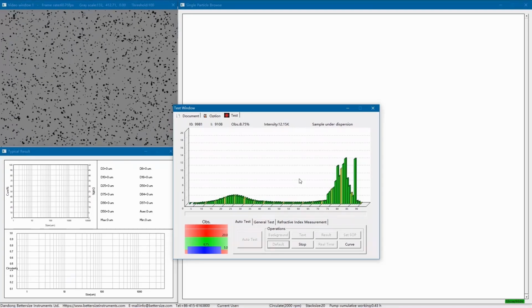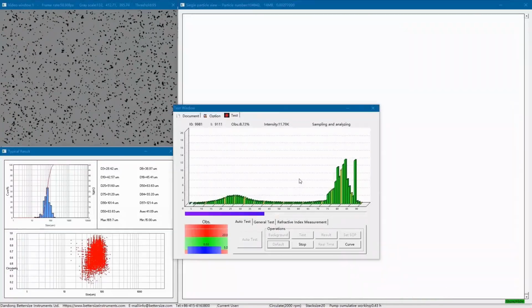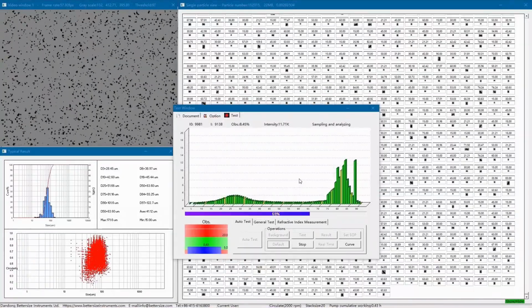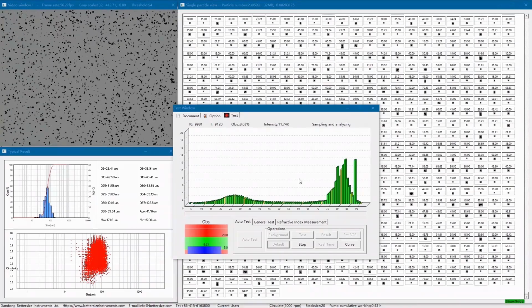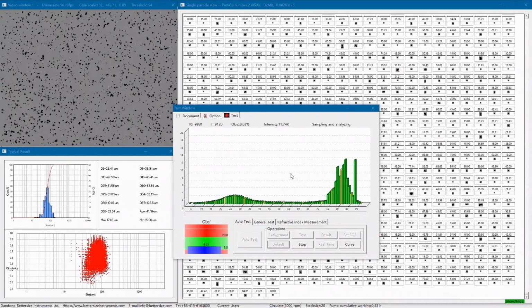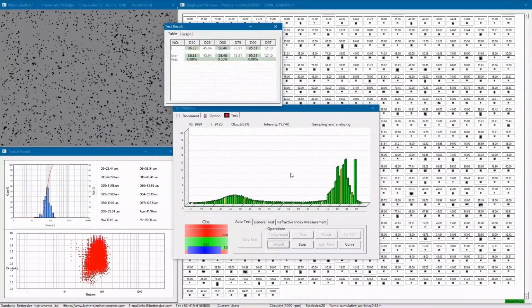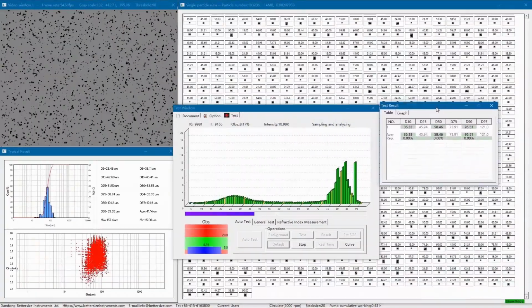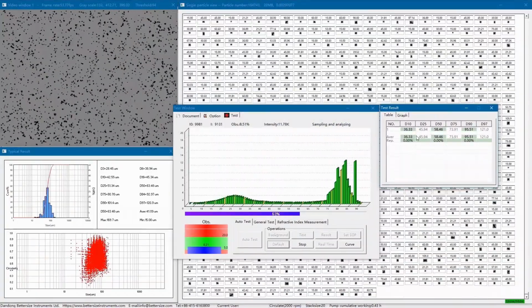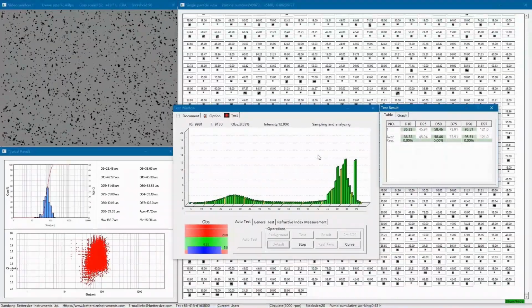Using the Bettersize dual lens and oblique incidence optical system, the Bettersizer S3 Plus has extremely high accuracy for very small particles. Our patented technology provides for the focusing and collection of the backscattering signals at a very wide angle range from 0.02 to 165 degrees, ensuring excellent detector resolution compared to other systems available in the market.